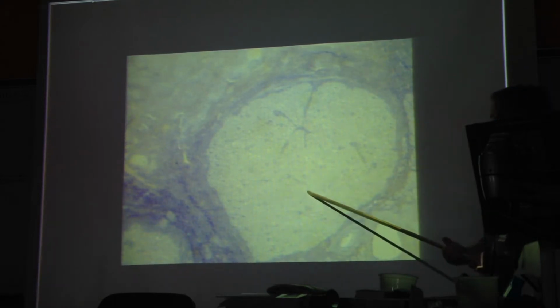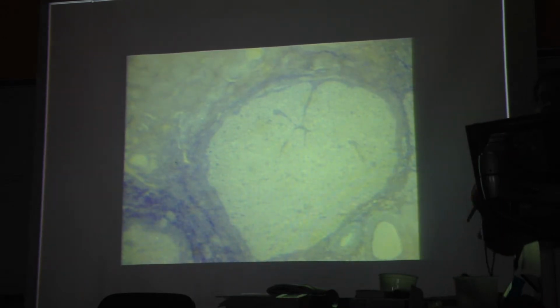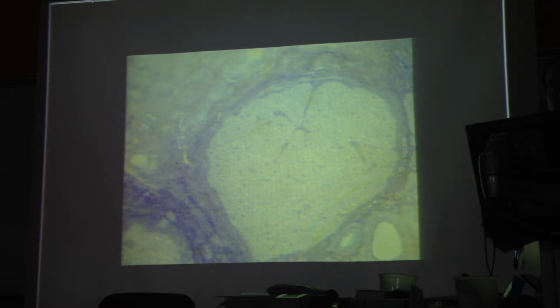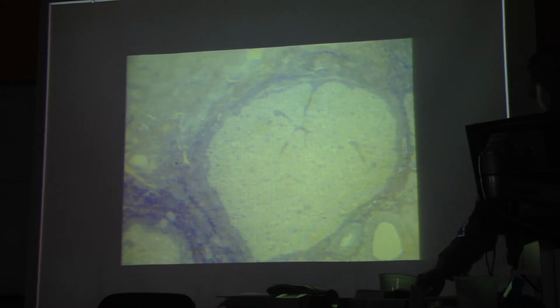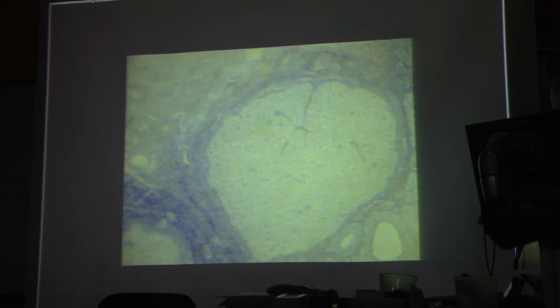What's its function? What does it do? It's a major source of female sex hormones. As the follicles are developing, they're producing sex hormones, particularly estrogens. That helps to build up the female body in preparation for possible pregnancy. The endometrium, the lining of the uterus, builds up. Mammary glands start to develop in preparation for lactation. So this secretes estrogens as a developing follicle, but also a lot of progesterone. Progesterone puts the finishing touches on the female body, readying it for pregnancy. And the progesterone is what maintains the endometrium, the uterine lining.